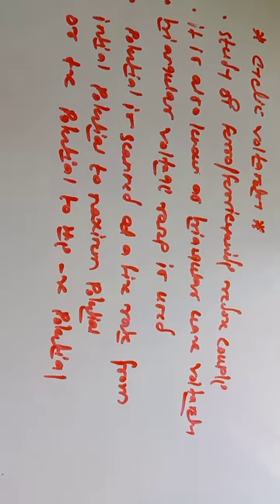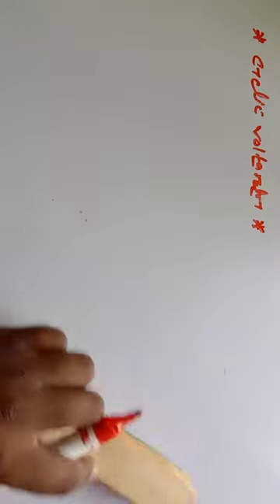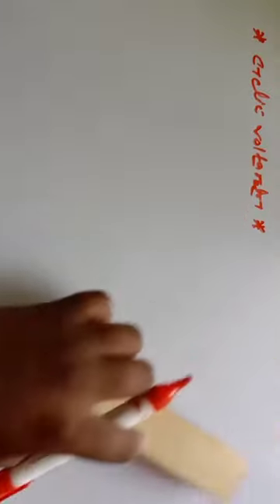So if you see the graphical representation for this cyclic voltammetry, you can see why it is also known as triangular wave voltammetry.